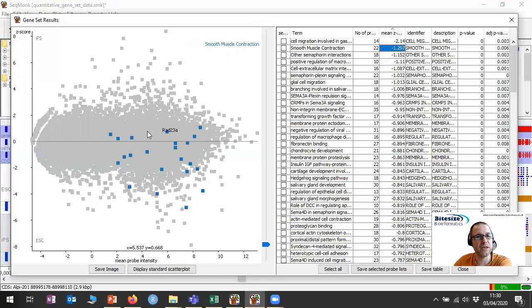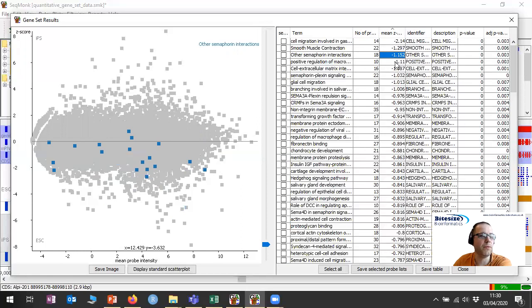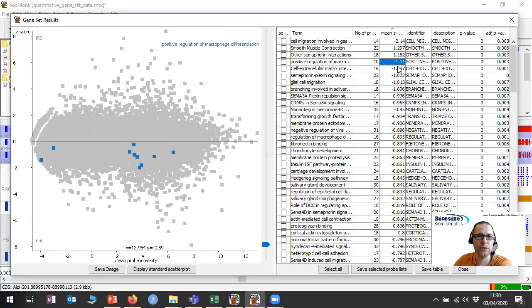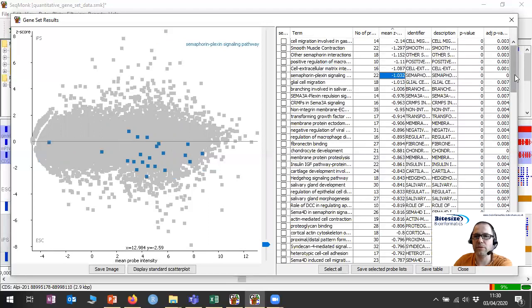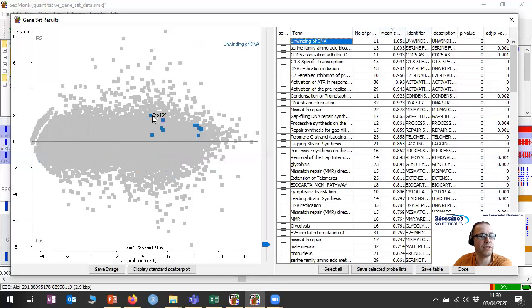Other entries should also show this. Here, there are even some positive genes in the set, but because there are 22 genes in the set, it's still unusually skewed low on the plot — so it comes out as being interesting. As we go further down, the magnitude of effect gets smaller but we can still see genes skewed below the line. If I go to the other end and sort the other way, I can look for the same thing going in the positive direction. These are now positive Z-scores. Clicking on 'unwinding of DNA', I can see that the points are all higher than the line all the way through, meaning they're higher in IPS — all the previous ones were higher in ESC.